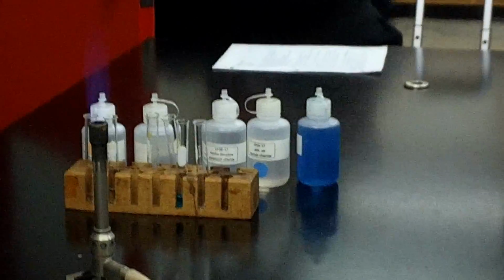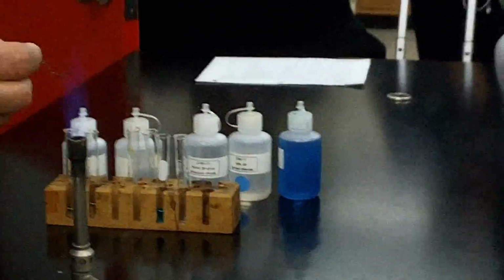And we'll look at several of these using the flame as a source. So let's do another one here. Get rid of the color pretty much. So we'll go to this, this is calcium. Calcium is pretty quick. You're going to make sure you have a little bubble in there. And there's calcium. All right. It's very fast. You have to be pretty quick at it.